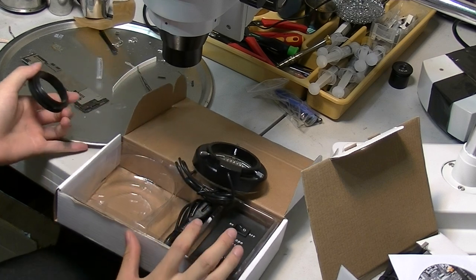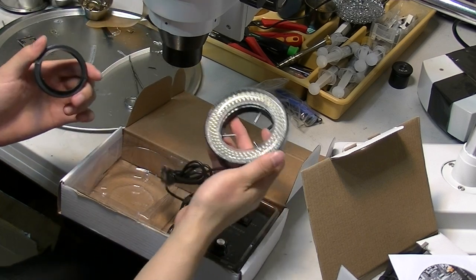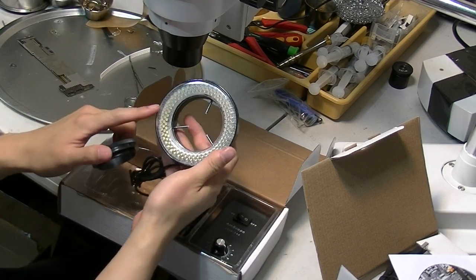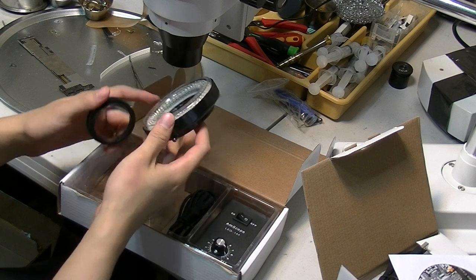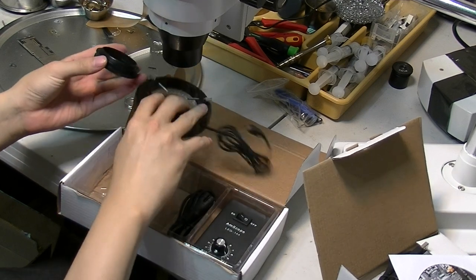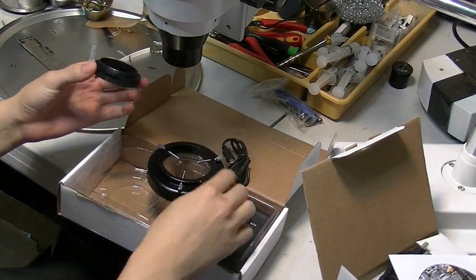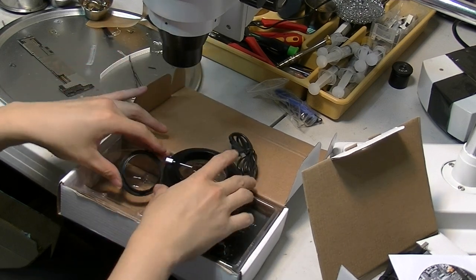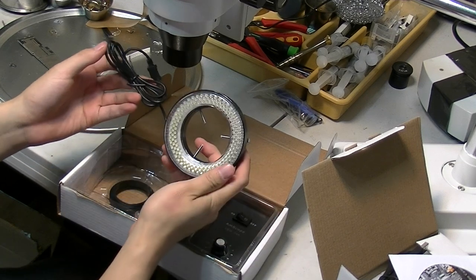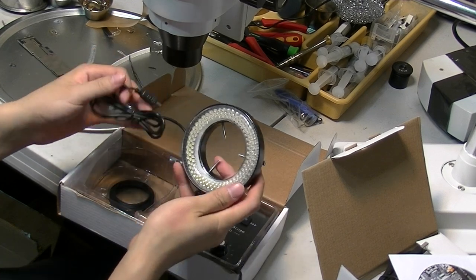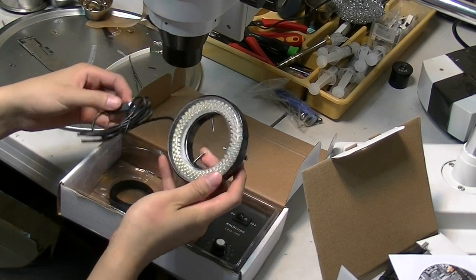This video is going to be showing you how to put on your LED lighting under your microscope. This is the LED lighting I am going to put on to this microscope.